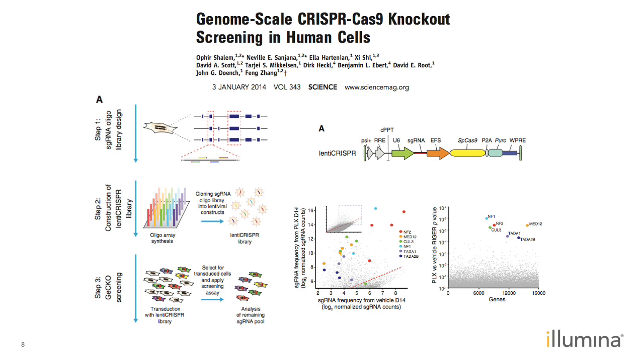Now, in order to validate their GeCKO library, this group tested the efficacy of their library by demonstrating its ability to enable both negative and positive screens. And so for their negative selection, they profiled the depletion of guide RNAs targeting essential surviving genes by transducing both a human melanoma and a stem cell line with the GeCKO library. And so here, they were able to reveal, after deep sequencing, a significant reduction in the diversity of guide RNAs in the surviving cells. And so here, the absence of certain guides in their sequencing results allowed them to conclude that those were knocking out essential surviving genes.